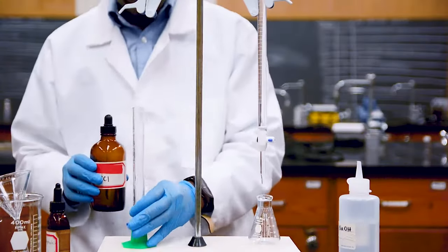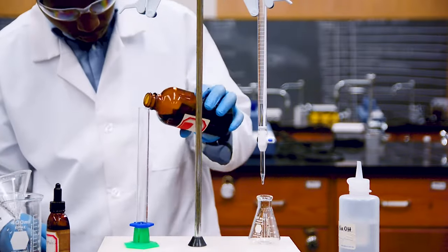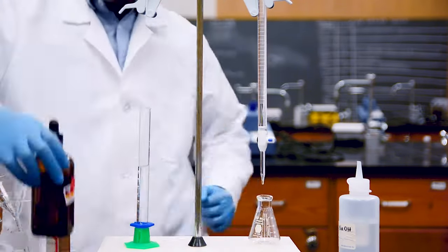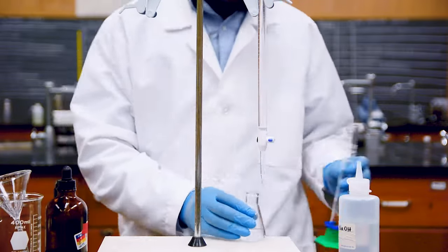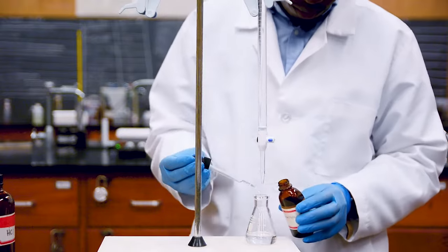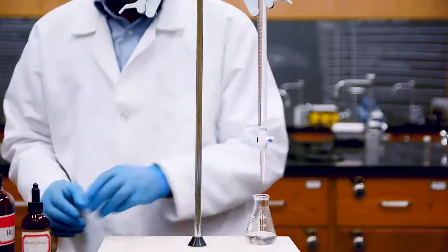Now let's put our acid in the flask, and place this directly below the burette. In this experiment we are using 20 milliliters of HCl solution, but again we don't know the concentration. Let's also add a few drops of the indicator. We're now ready for the titration.